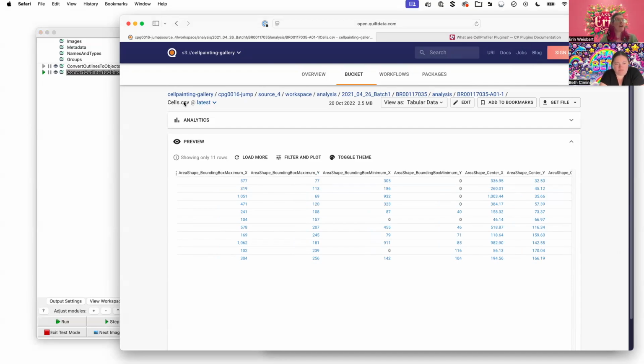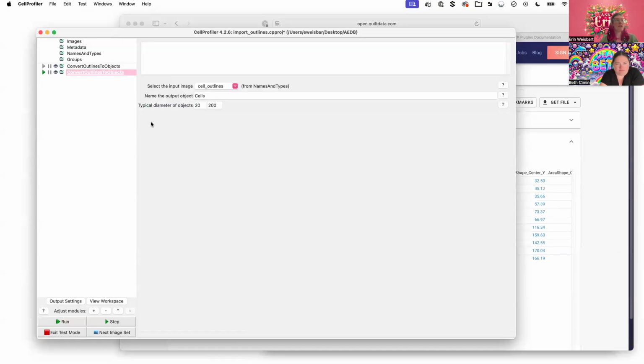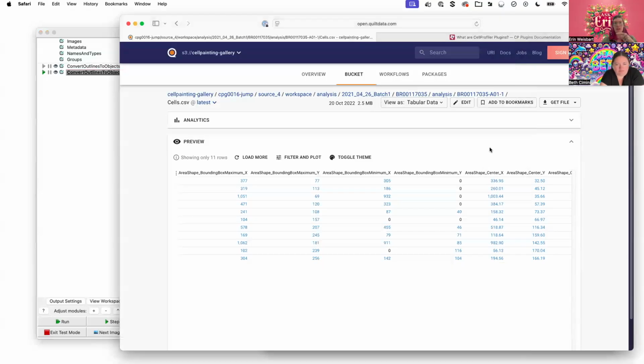If I made a bunch of measurements on these cells and wanted to be sure that they matched perfectly with existing measurements I had made, I could use the bounding boxes or the cell centers to perfectly match and filter them in my downstream data.